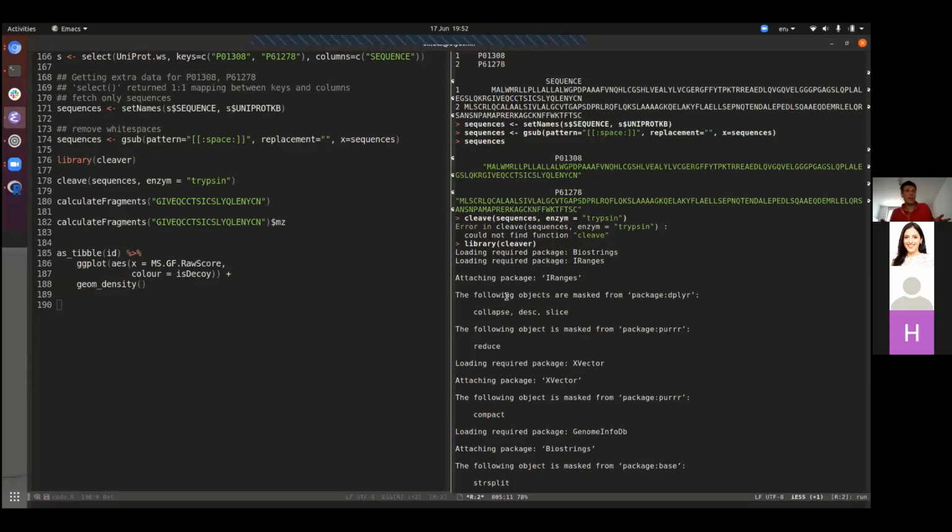So if these were human cells, you would use the human database, so a database with all the human proteins. And the software will automatically do all these analyses for you to then return a list of proteins that were present in your respective samples. Okay. So that will get you a list of proteins.